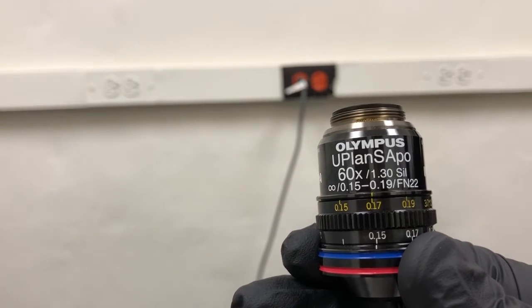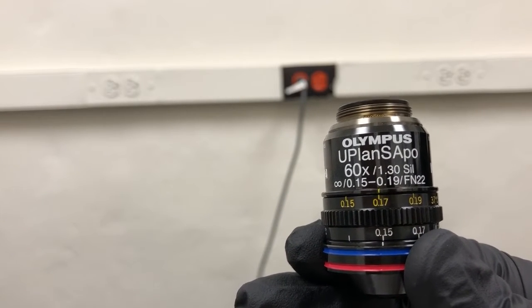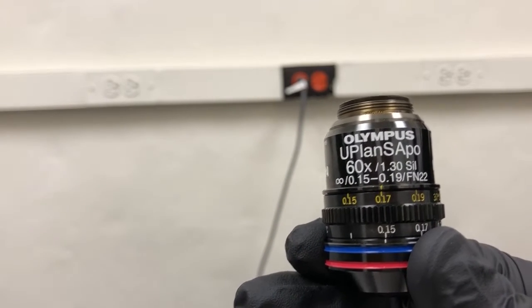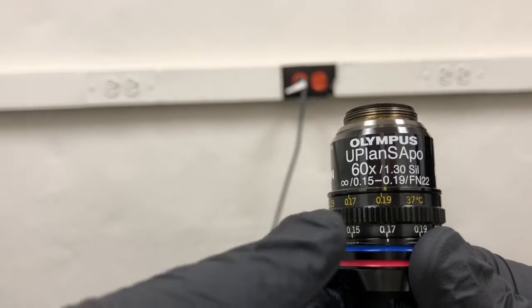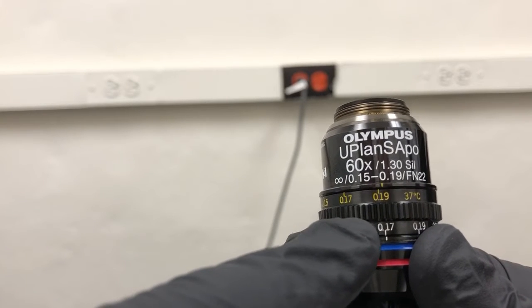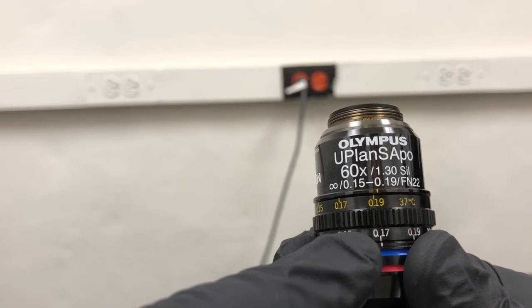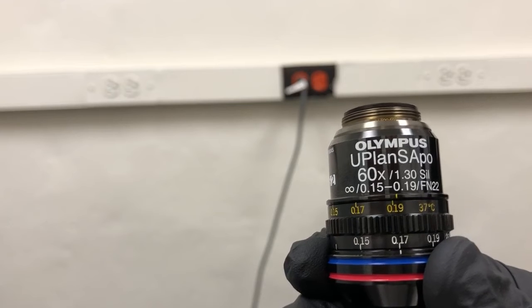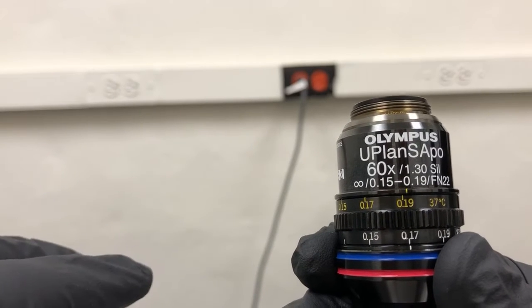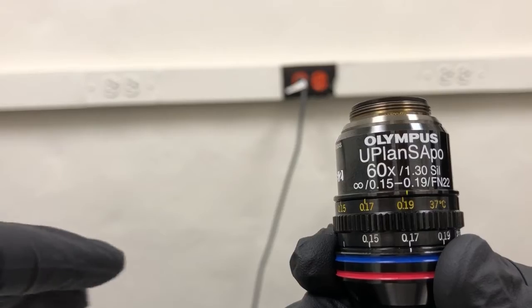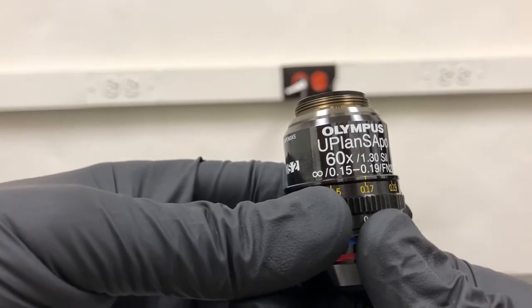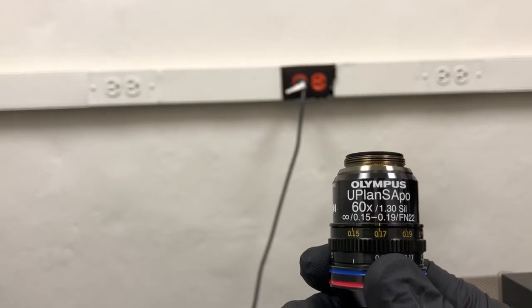If instead we're using a sample at room temperature or we're working with fixed samples where we wouldn't turn on the temperature controller, we want to align the bottom 0.17, the one that's in white for room temperature, with the white marking. Because I'm going to show you how to do live cell imaging, and because that is what is most typically done on this microscope, I'm going to put it back to 0.17 in the orange position.